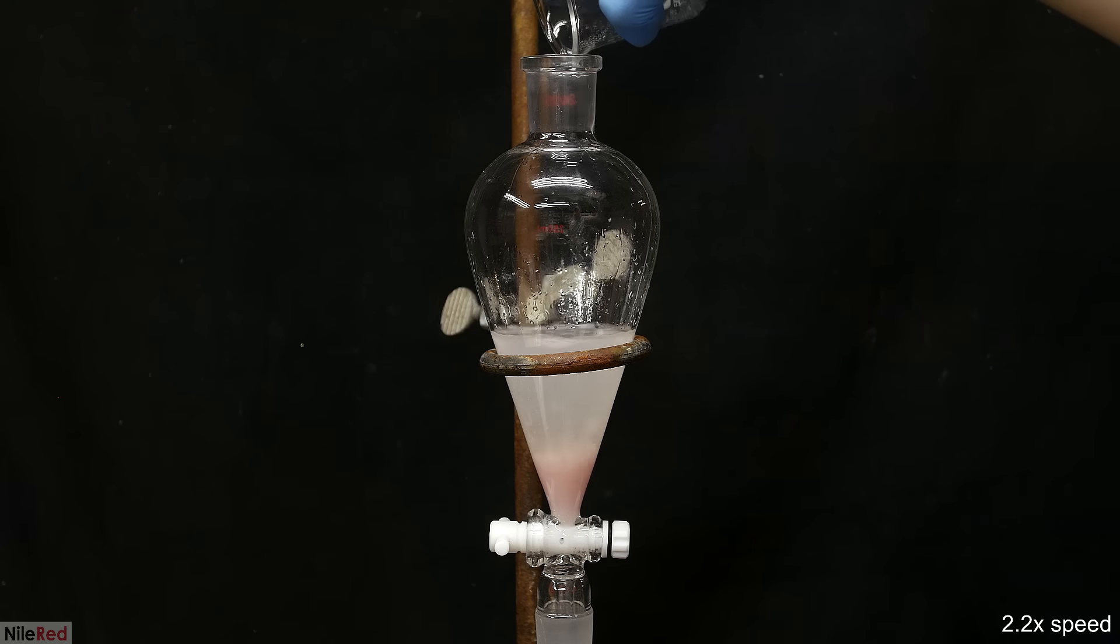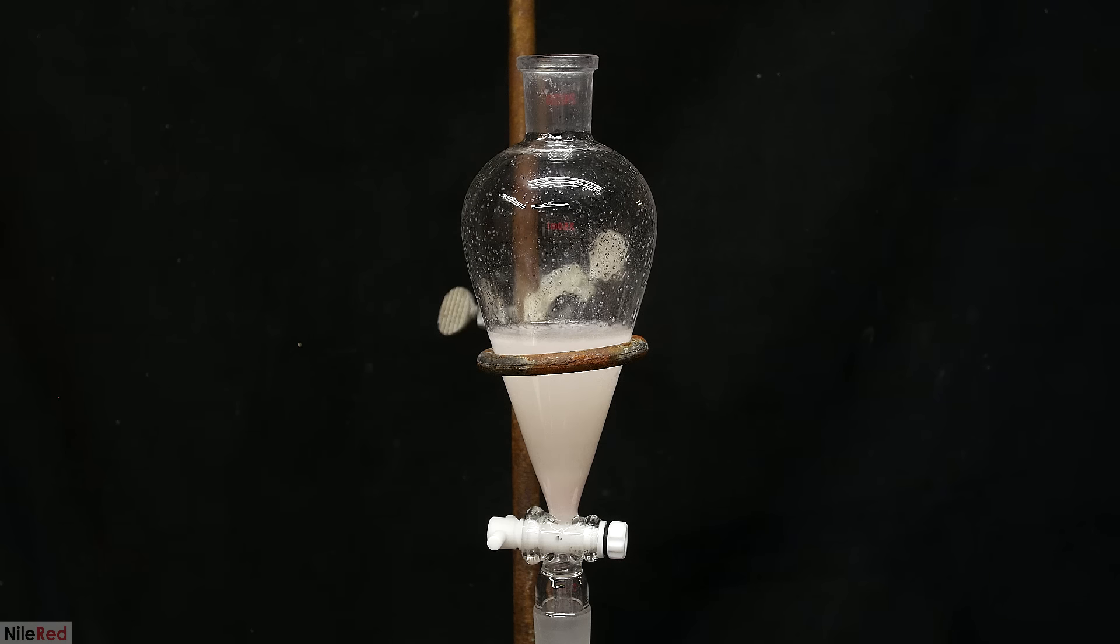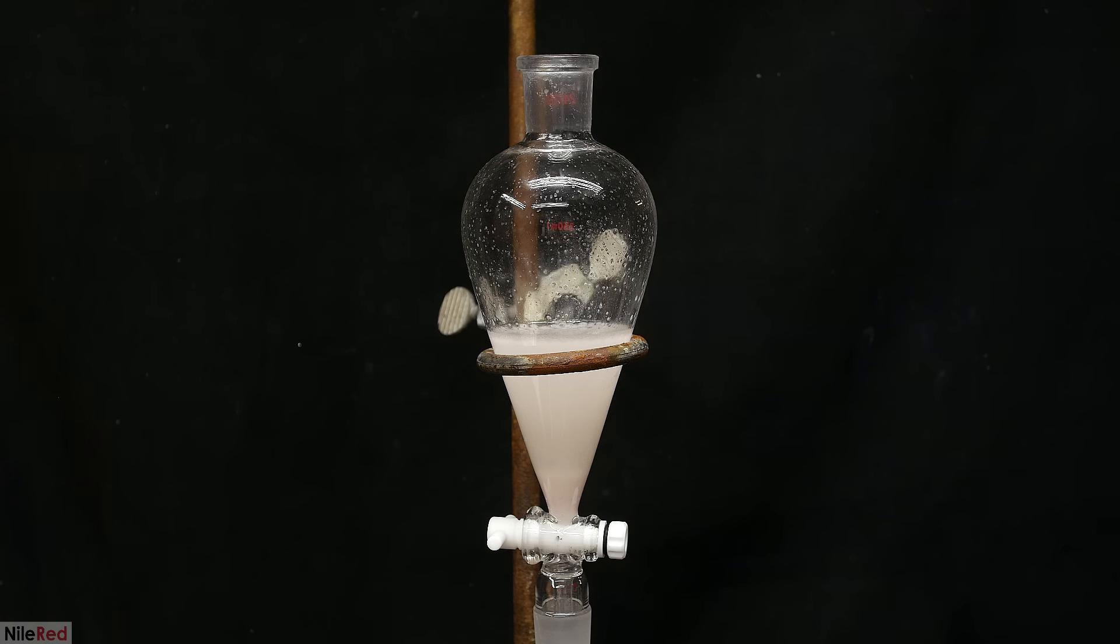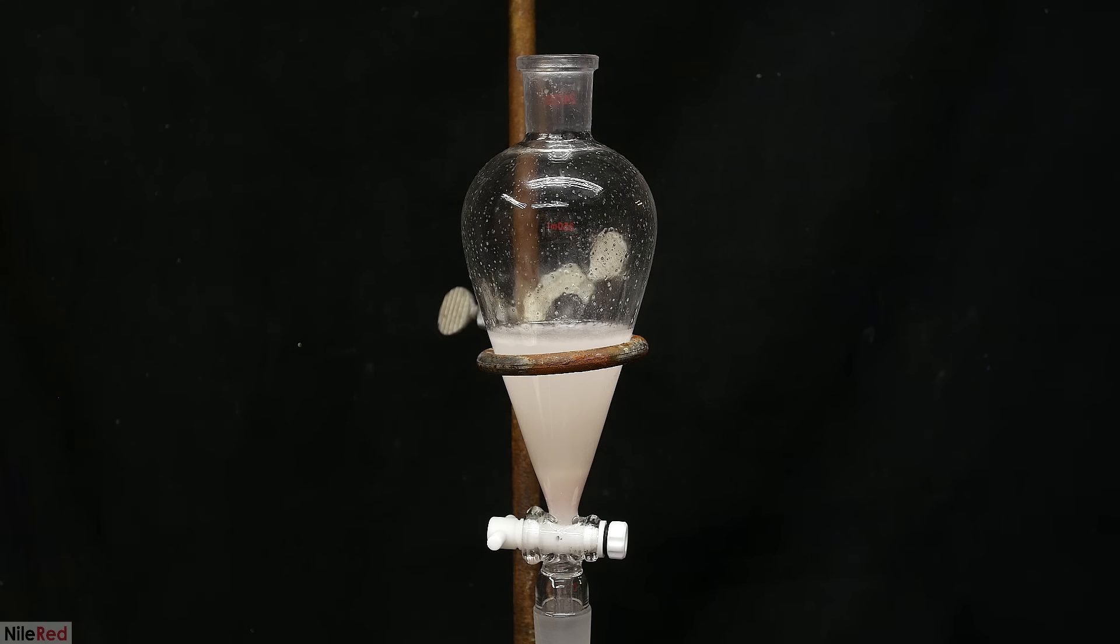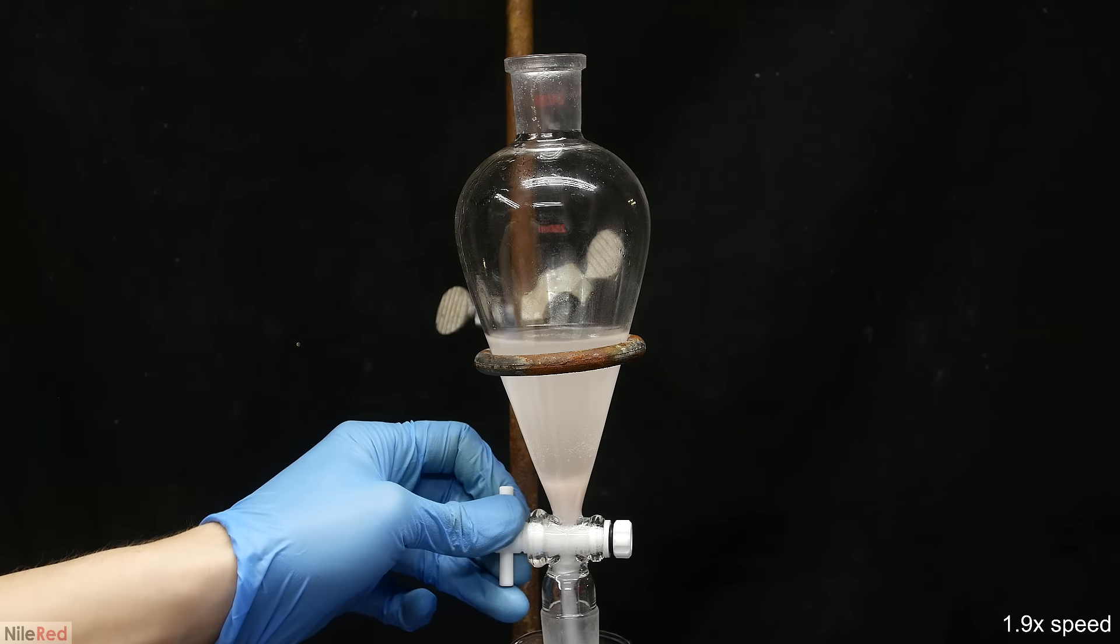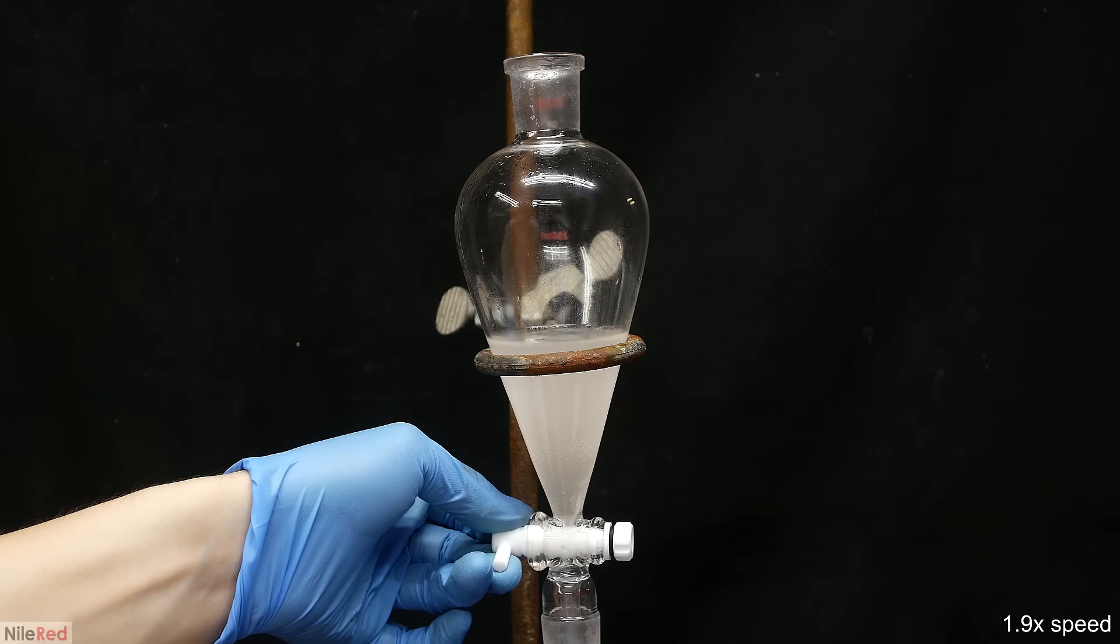To get rid of any acid that might remain, I wash it with some saturated sodium bicarbonate solution. To really mix it up, I cap the funnel, shake it, and vent it, but I have to be really careful because a lot of CO2 is being generated. I wait for about 30 minutes for the layers to separate, then I drain off the lower one, and I repeat this same washing one last time.